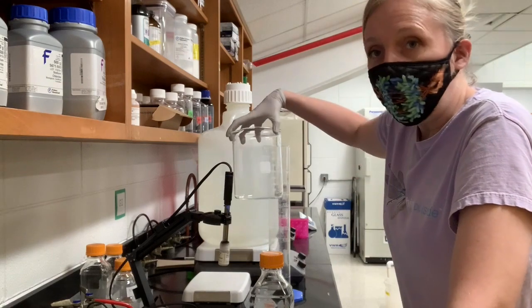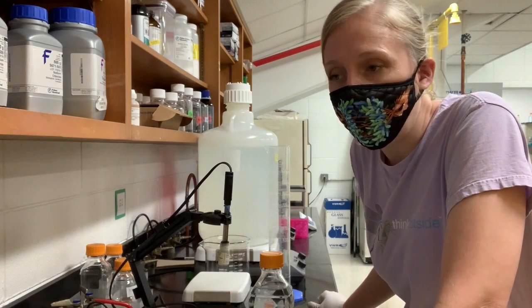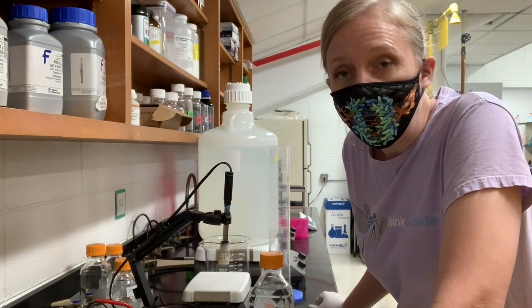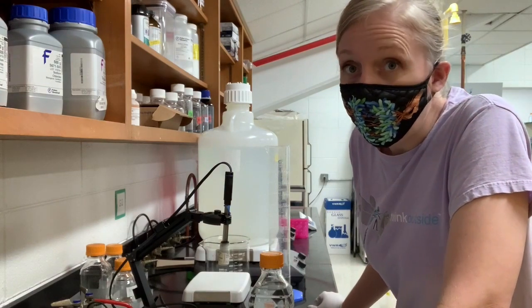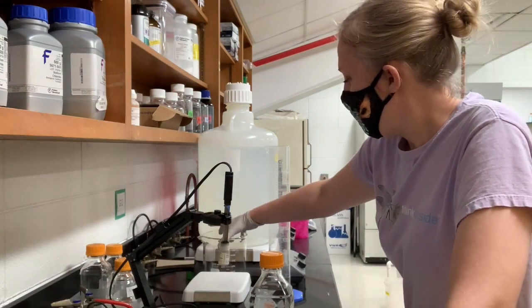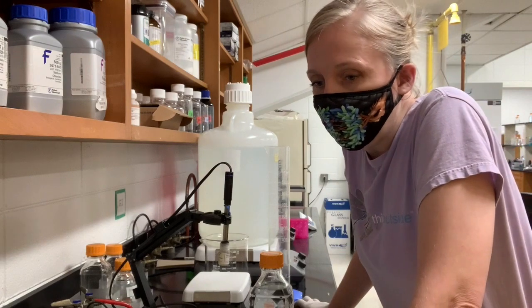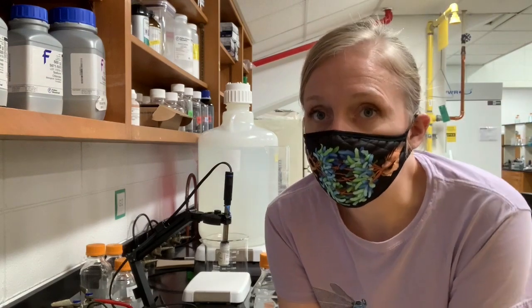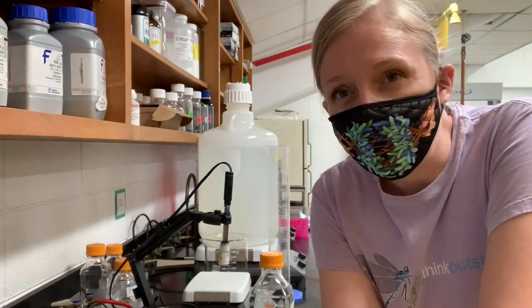You also want to clean your glassware. So these can be taken to the sink and just washed out with water and left on the brown tray that's right by the sink for glassware washing. And you can talk to us if you're interested in helping out with glassware washing and stuff like that. So both my graduated cylinder and my beaker are going to be washed. And then the last thing I'm going to do after I take care of that is to DEPC treat my solution. And what I'm actually going to do is DEPC treat both this PBS solution and also some water, and I will explain that to you in just a moment.